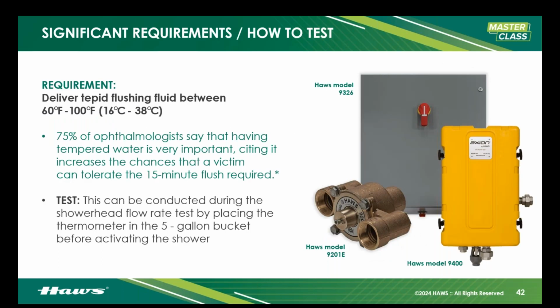That equipment also has to provide a tepid flushing fluid range from 60 degrees Fahrenheit to 100 degrees Fahrenheit, 16 degrees Celsius to 38 degrees Celsius for my homies up north. 75% of ophthalmologists say that having tempered water is very important, and cite specifically that it increases the chance that a victim can tolerate a full 15-minute flush.